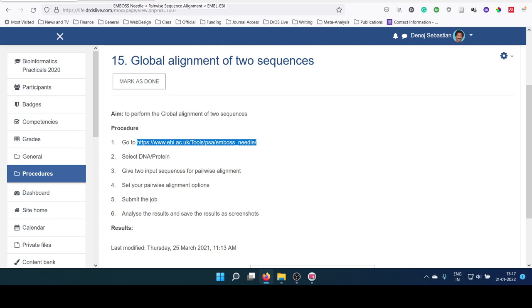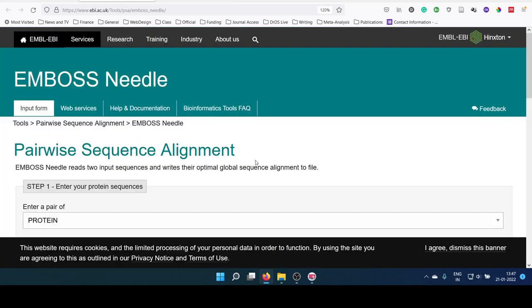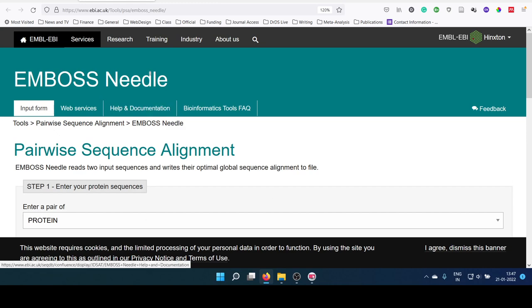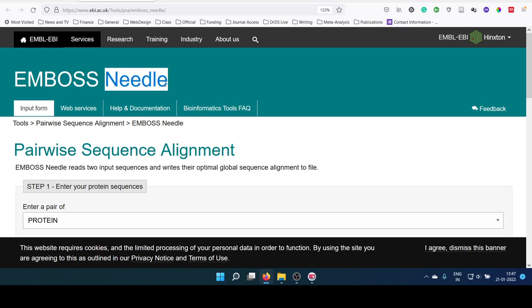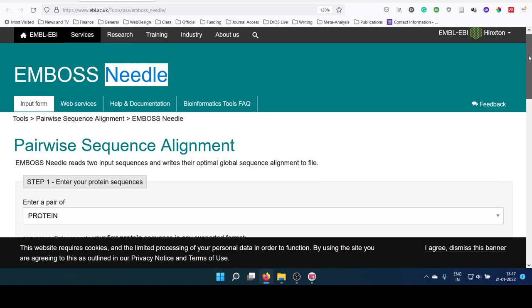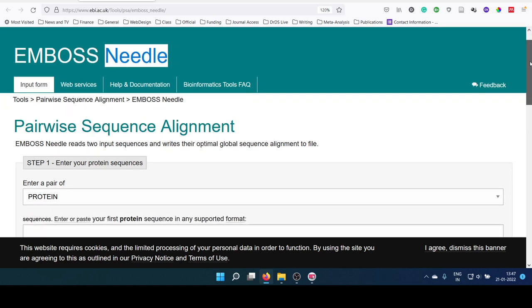This is the pairwise sequence alignment page of EMBOSS package using the Needle algorithm. Needle corresponds to Needleman-Wunsch. EMBOSS is a European Molecular Biology Open Software Suite.